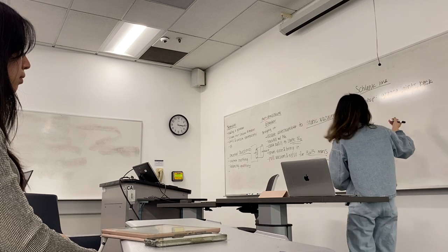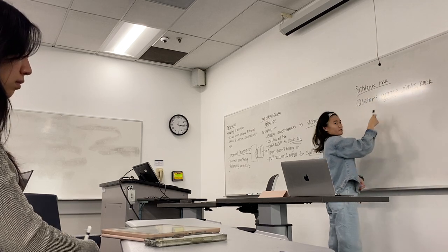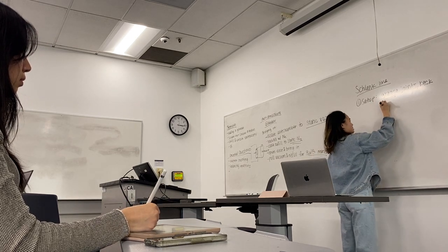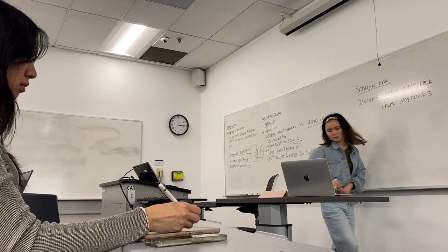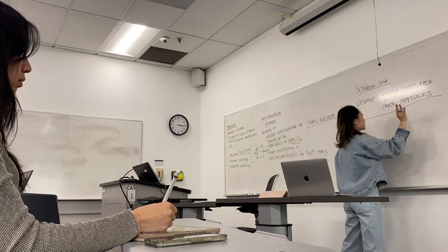And also, I feel like the biggest mistakes people always make is to forget to grease things. And people always forget to check your stopcocks. So if we have a setup here, I'm going to attempt to draw a Schlenk line.